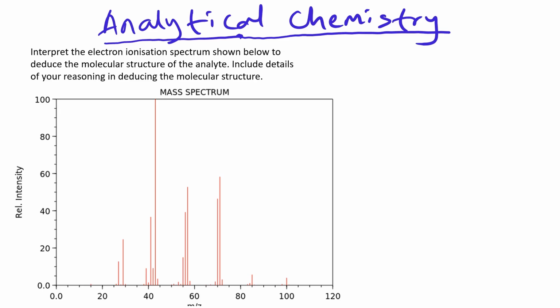Okay, so now we have to do the same thing here. Interpret the mass spectrum, deduce the molecular structure, and while doing that, include your mode of reasoning. Okay, how you're able to come to the conclusion. I want you to pause the video and attempt the question.